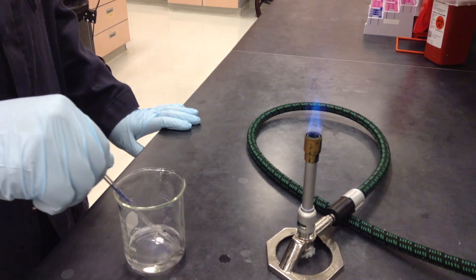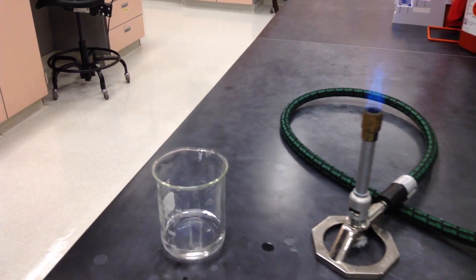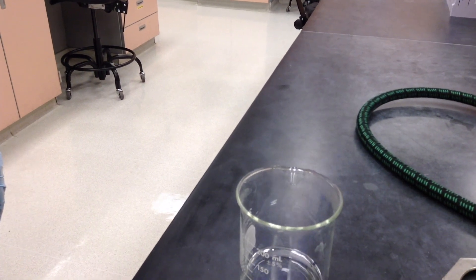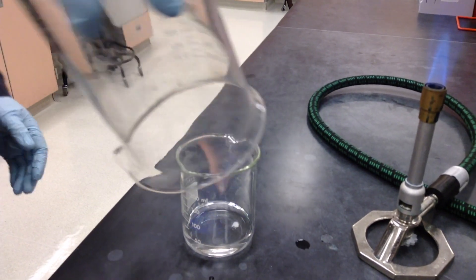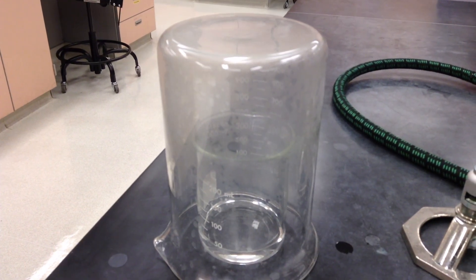An ethanol fire in a beaker can be put out by simply placing a larger beaker over the beaker with the fire. Placing the beaker over the fire will cut off the oxygen supply, thereby extinguishing the fire.